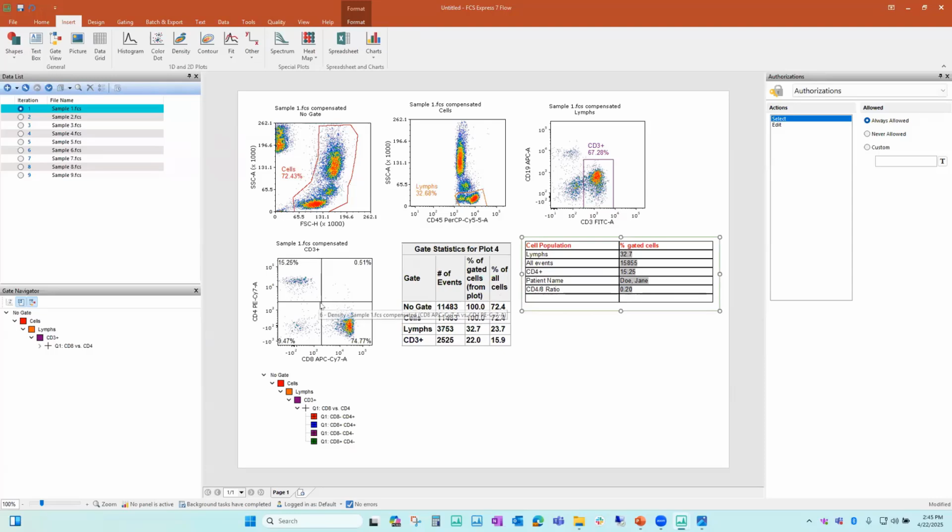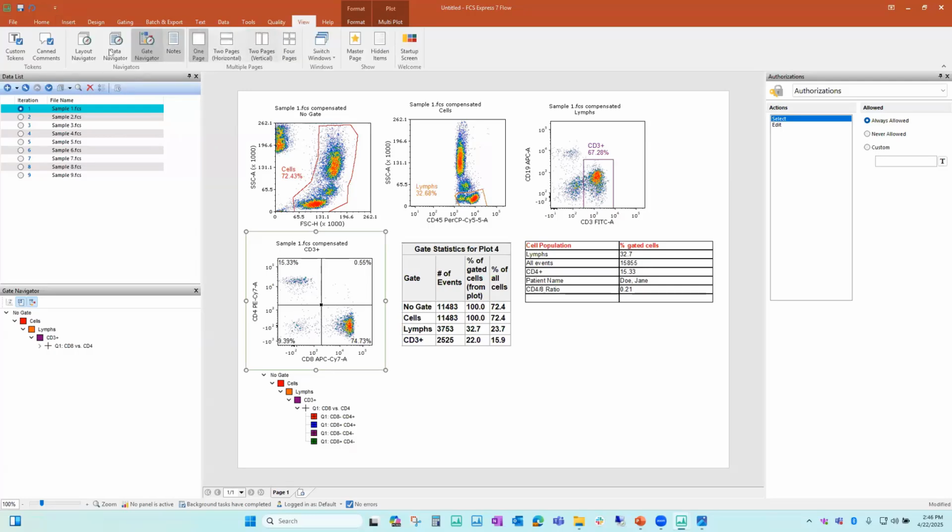And now that ratio will still update in real time in the backend. So that spreadsheet is still part of my layout. I just can't see it here. I've done calculations here, and I've used them to add to my table. Okay. If I want to see that spreadsheet, it's important to note that it's still part of your layout. So if you wanted to truly delete it, then we would want to go into our data navigator under view data.